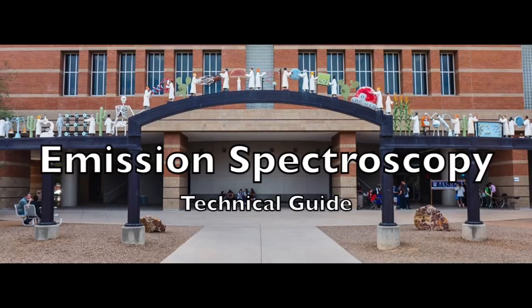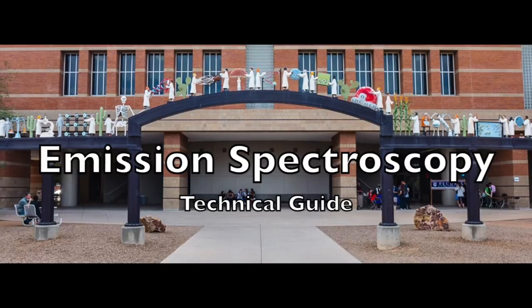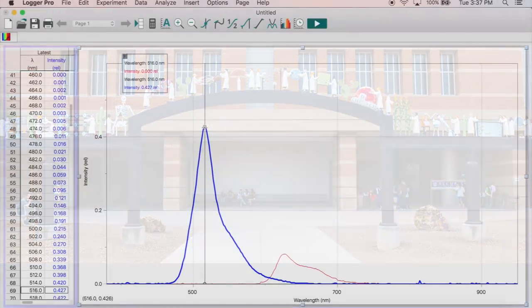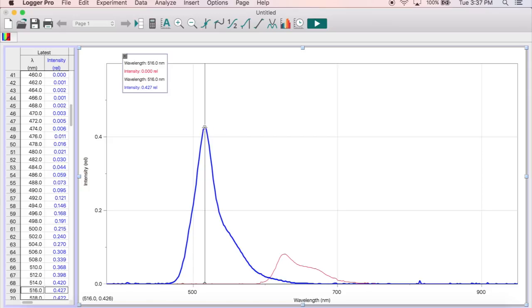In this video, I will demonstrate how to perform emission spectroscopy using a spectrometer and LoggerPro software. Emission spectroscopy allows you to quantify the intensity of light emitted from a substance, as well as determine the wavelength of light that it emits.